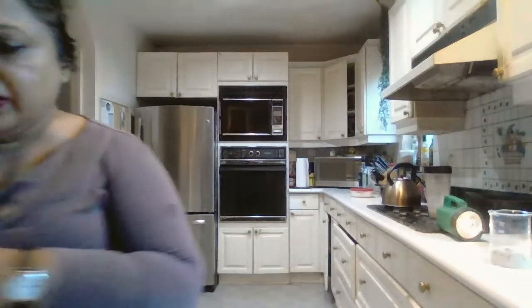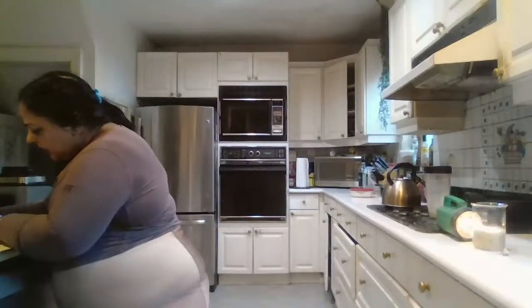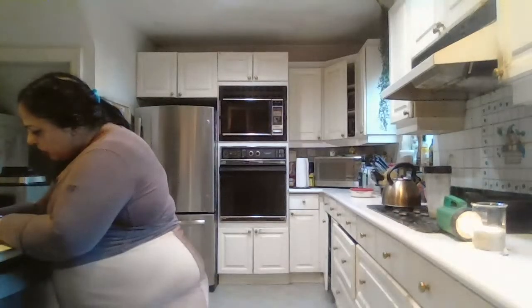100, 200 ml. Lower meniscus. Yeah, it's correct. All right, so 200 ml of water with 40 grams of oats. There's 5 grams of protein only.